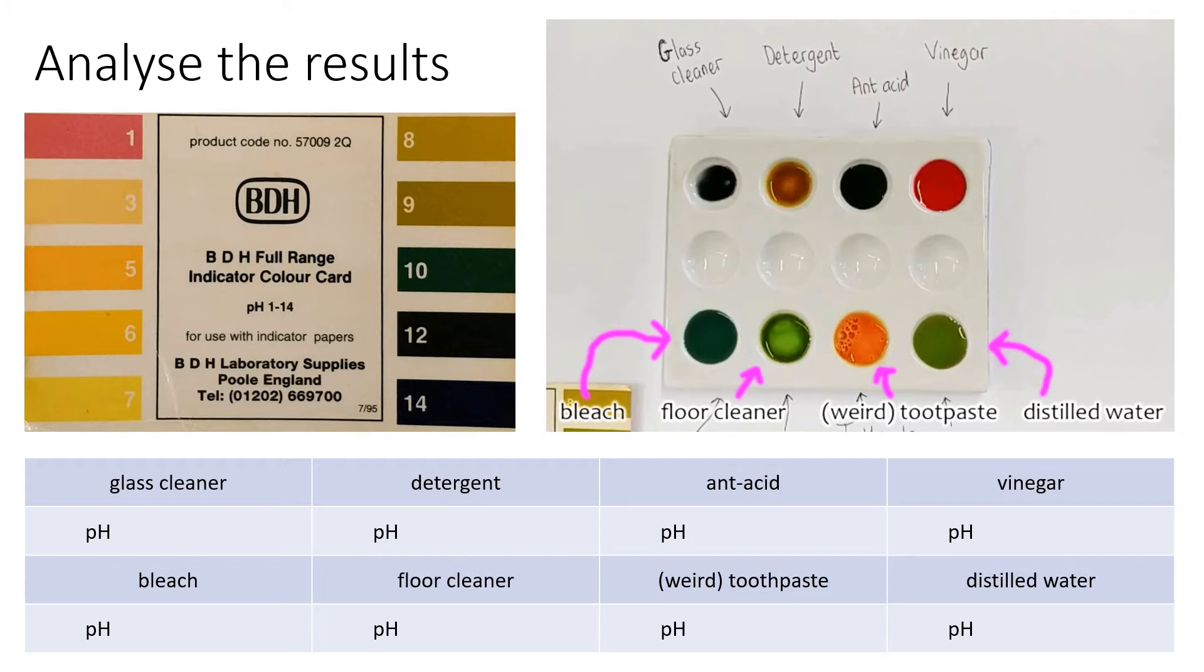The toothpaste is the one that really threw me because when we dropped the universal indicator in, it was an alkali color but it changed to an acidic color, which is very strange. Also the distilled water gave us a very strange result because according to our color chart, green is very much an alkali and distilled water is pretty much the very definition of pH 7. And in the table below you can see that it's empty and we're about to go to the results.